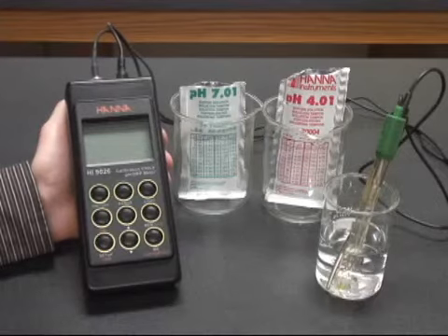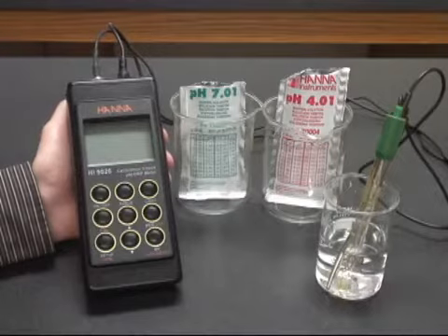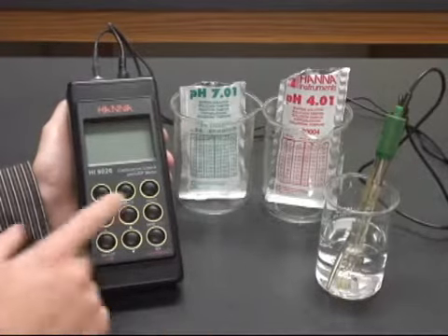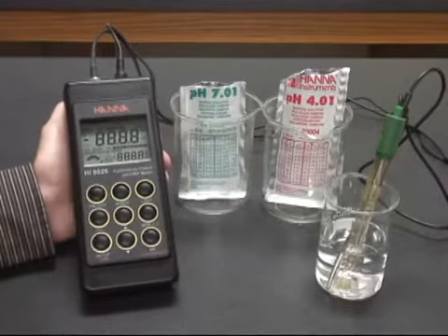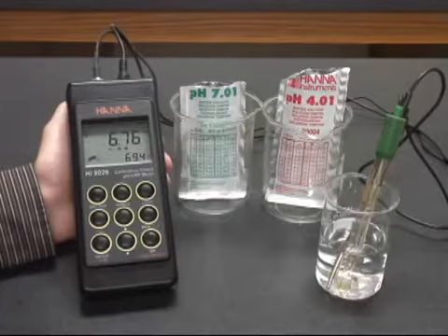This is a short video on how to calibrate the HANA Instruments Portable pH Meters, the HI90 and 91 series. First we're going to turn on our meter and let the LCD completely load into measurement mode. You see it doesn't take very long.